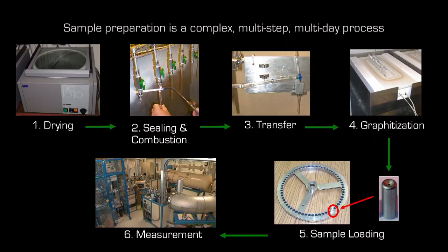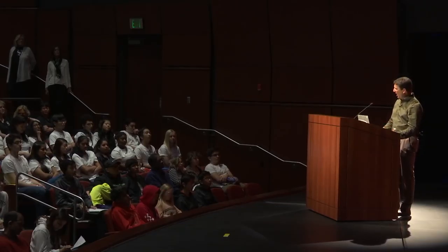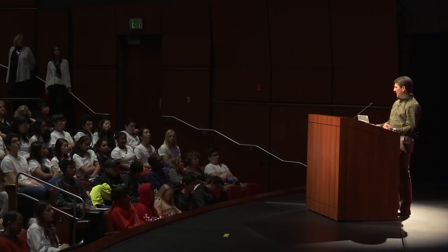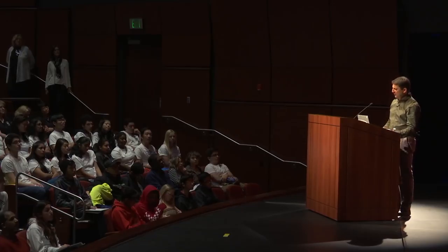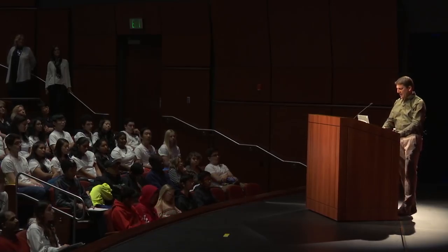So this takes a long time, and it's laborious, and it's costly as well. So we're trying to come up with ways to reduce the time it takes for our analysis, to increase our throughput, as well as reduce the cost of how much it costs to do these analyses. So we've come up with this way. We call it our online system, where we can actually get results in real time.